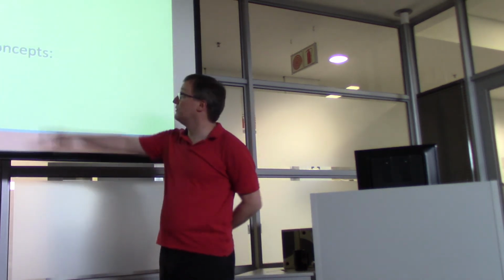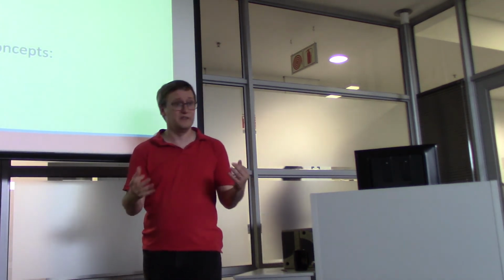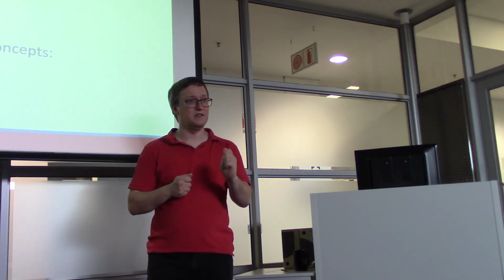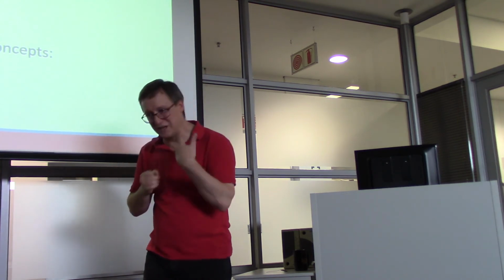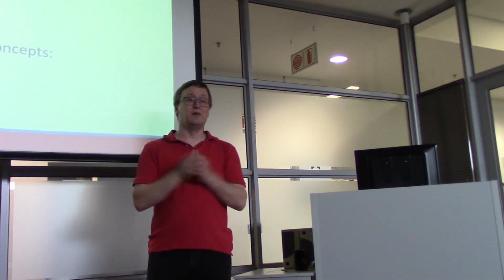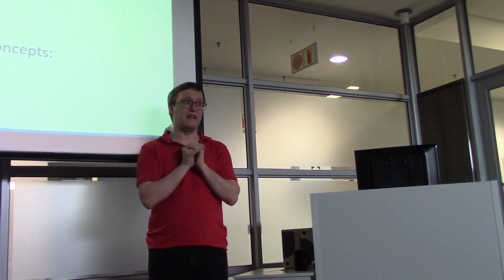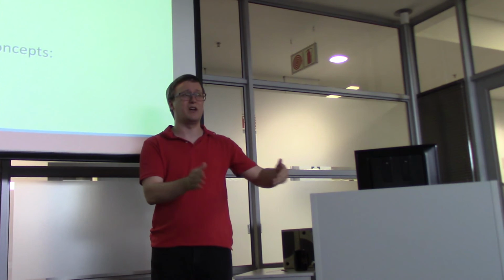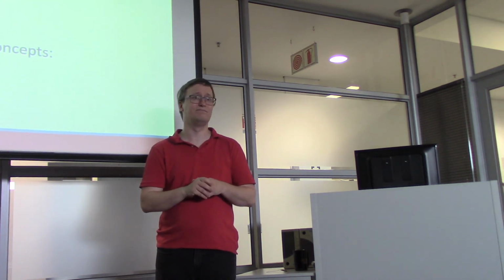Okay, so we talked about several different key concepts. I realize that there was a lot here, and if you've never heard of flow cytometry before, this might have been a little eye-opening and shocking even. But I want you to remember that flow cytometry is imaging for microfluidics in the same way that fluorescence microscopy is about being able to visualize these dyes in a 2D or even 3D field of view. So I hope that's useful to you, and this is all I'm going to say about imaging informatics. So if you have questions about it, I'll be happy to point you to particular papers that might illustrate how to accomplish a certain thing in ImageJ, for example, if the data you're producing could benefit from that.